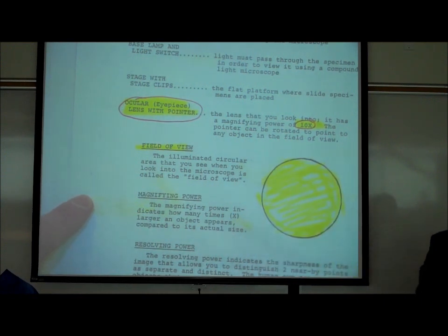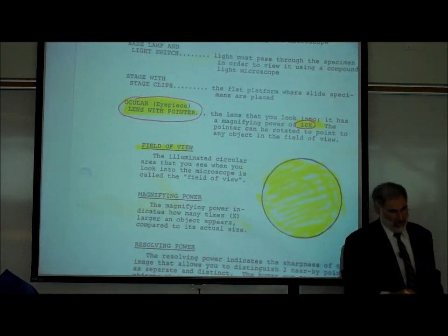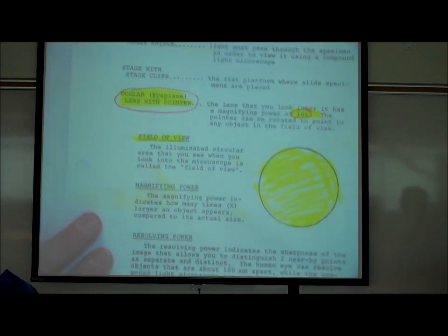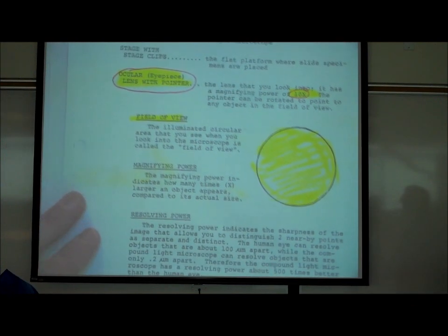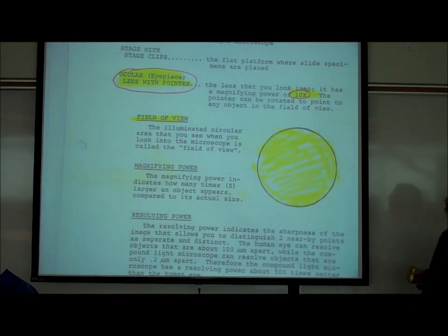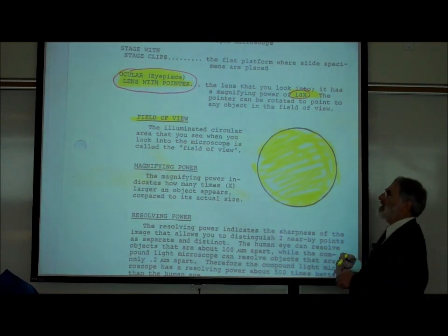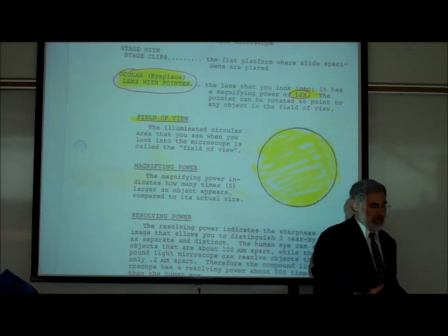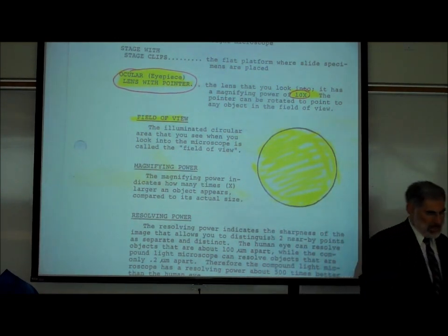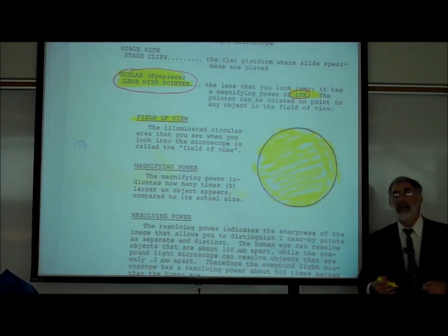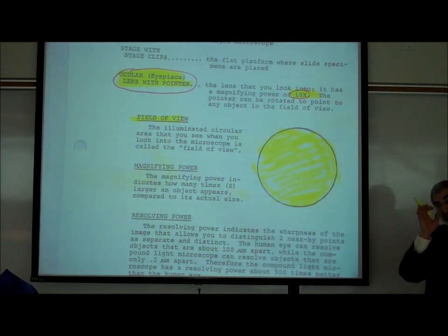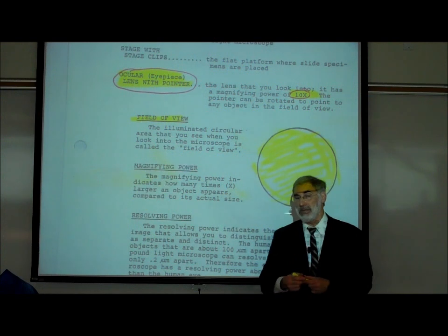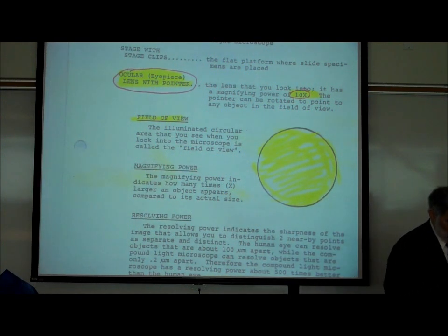If you don't see anything when you look through it, don't worry — we're going to get it corrected in just a moment. The magnifying power refers to how many times larger an object appears compared to how big it truly is. The eyepiece or ocular lenses make something appear 10 times bigger than it really is.